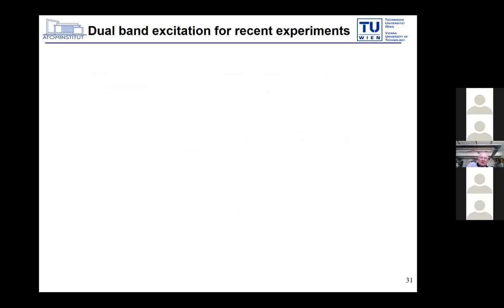Next we show some new approach, where we have the multilayer as usually available in our beam path, but this multilayer acts as a fantastic polished mirror as well.